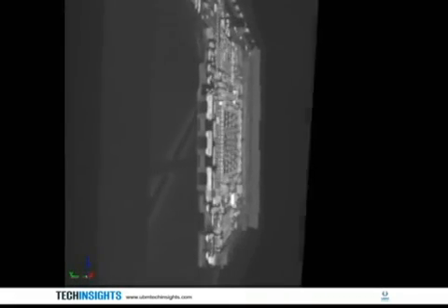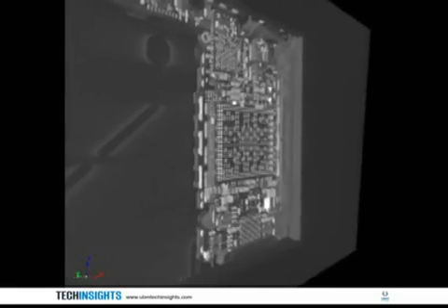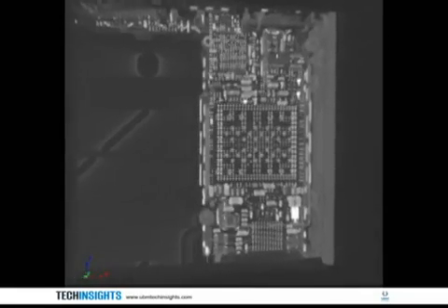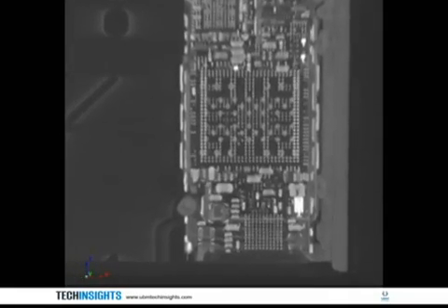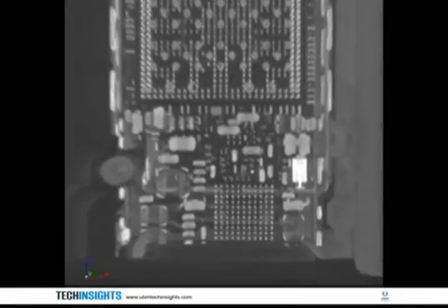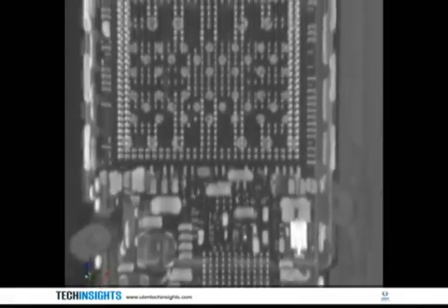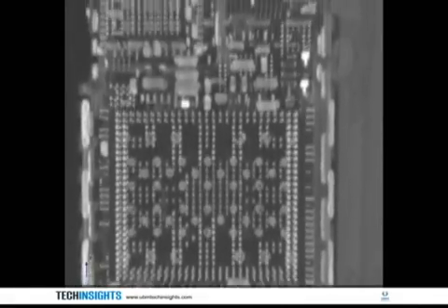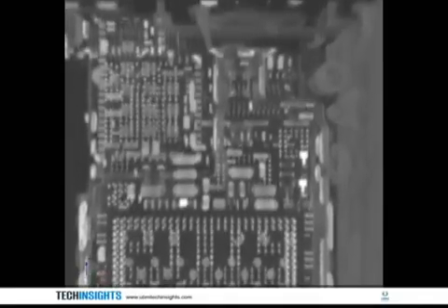As with most x-rays, metal shows up, and in this case, the ball grid array of many components are visible. Large, passive devices also show up well in this type of x-ray. The large ball grid array shown in the middle of the image is the A4 applications processor.